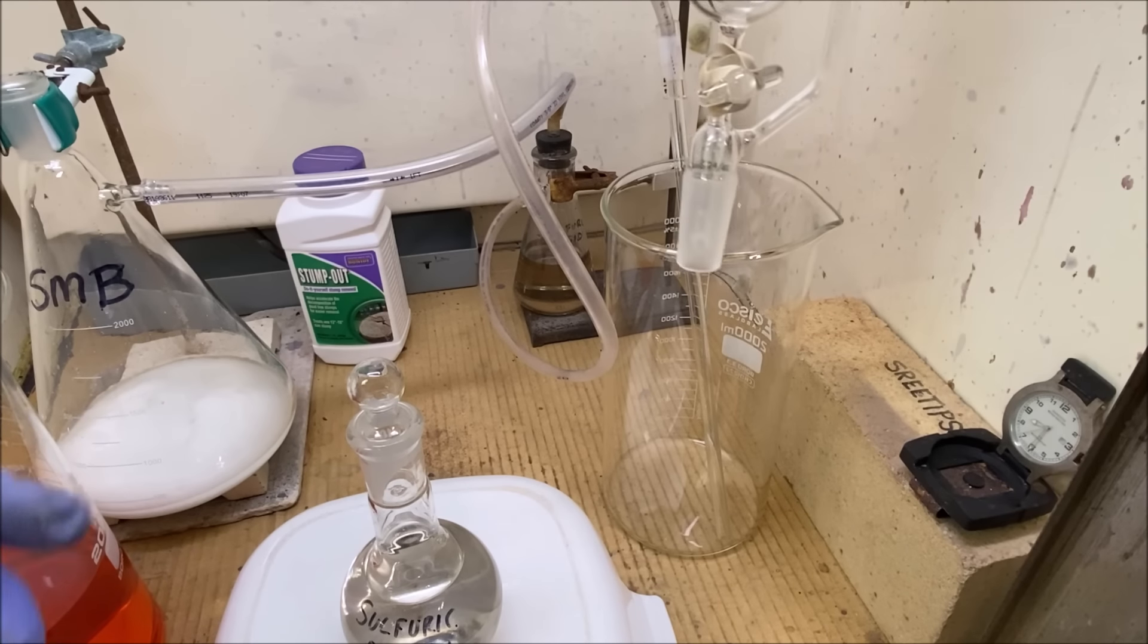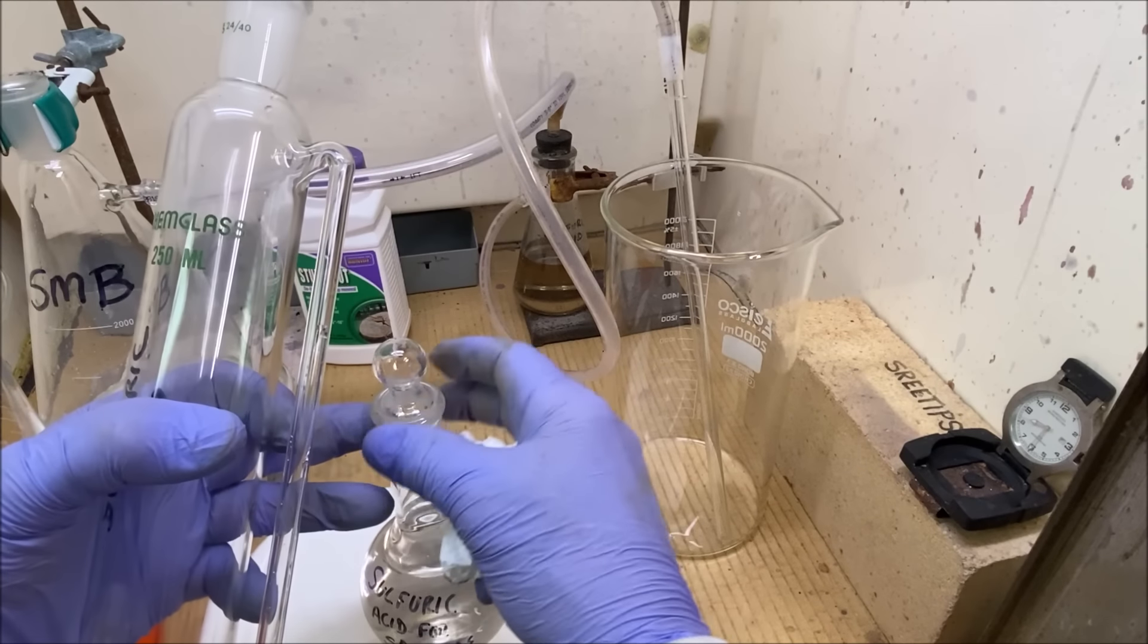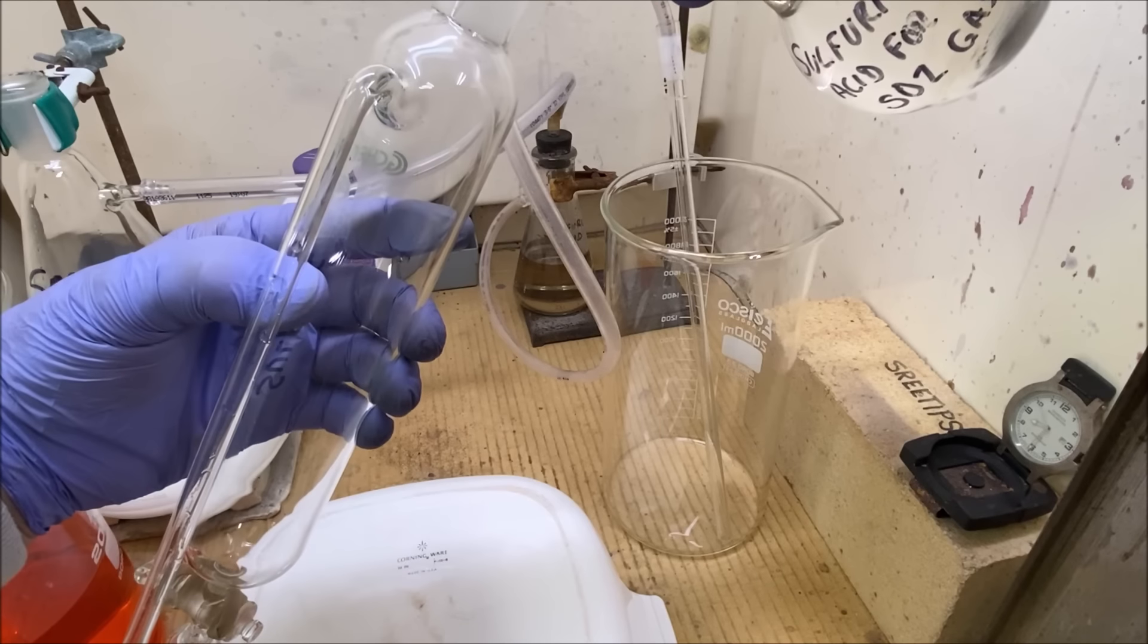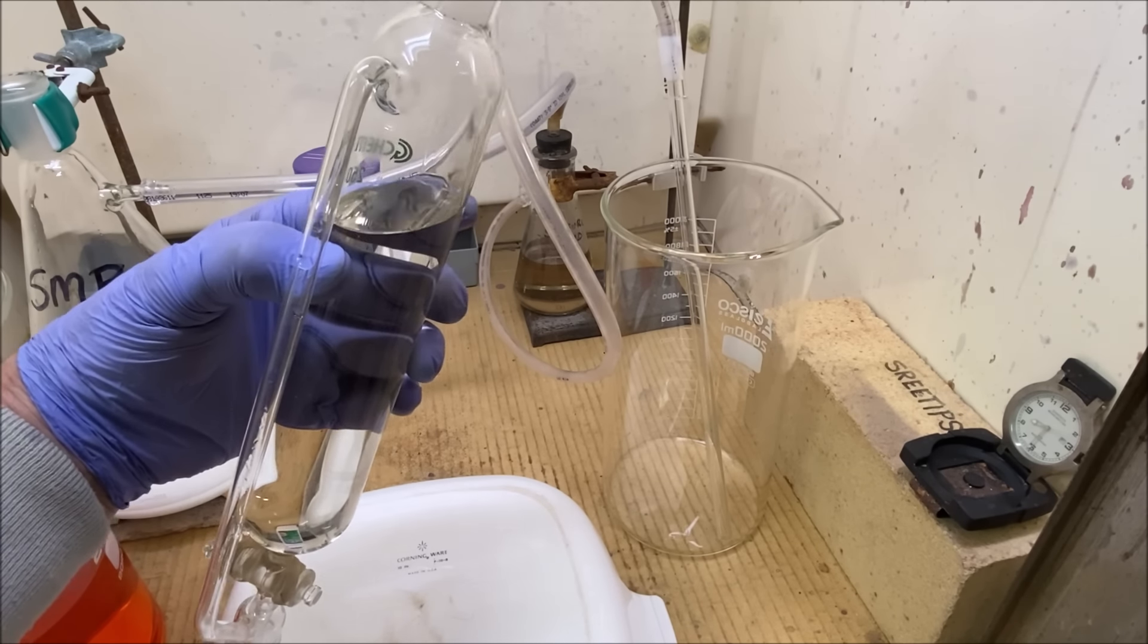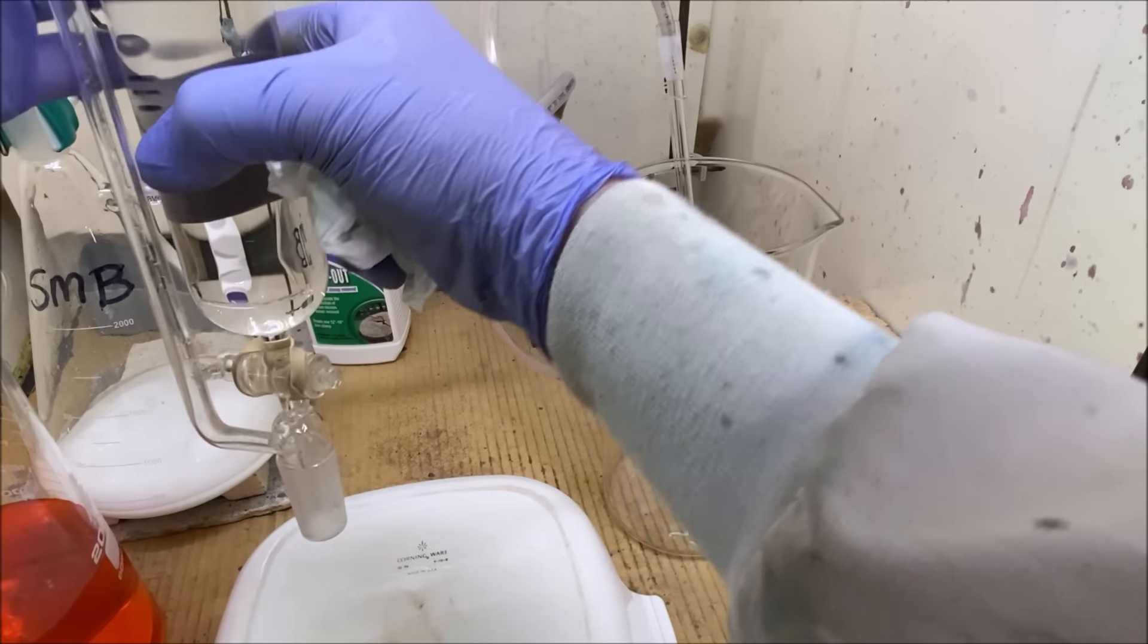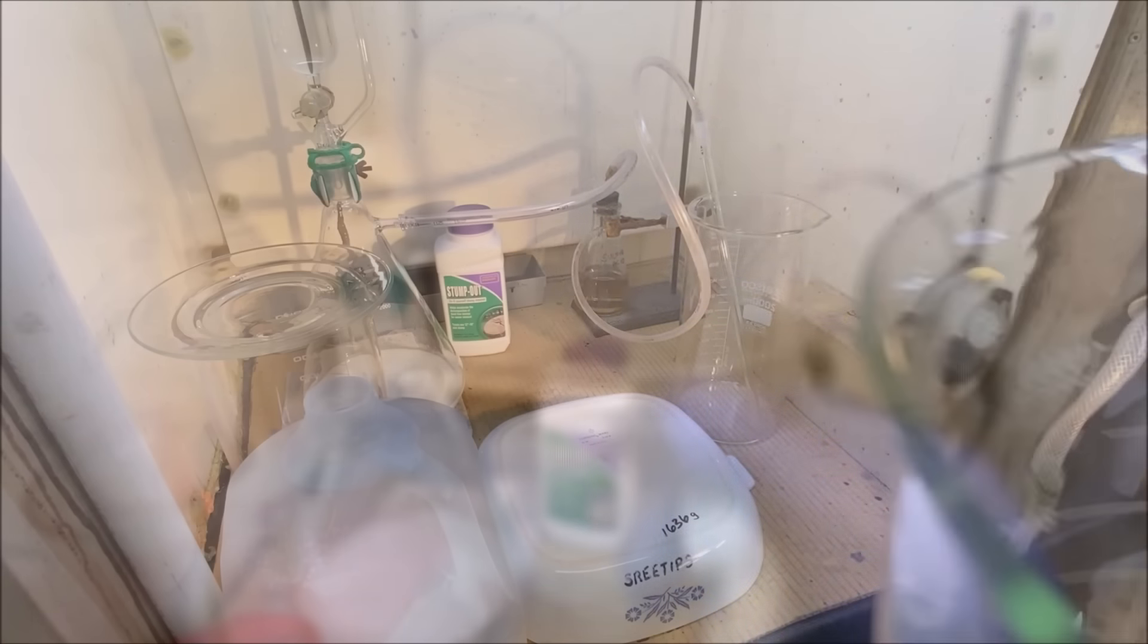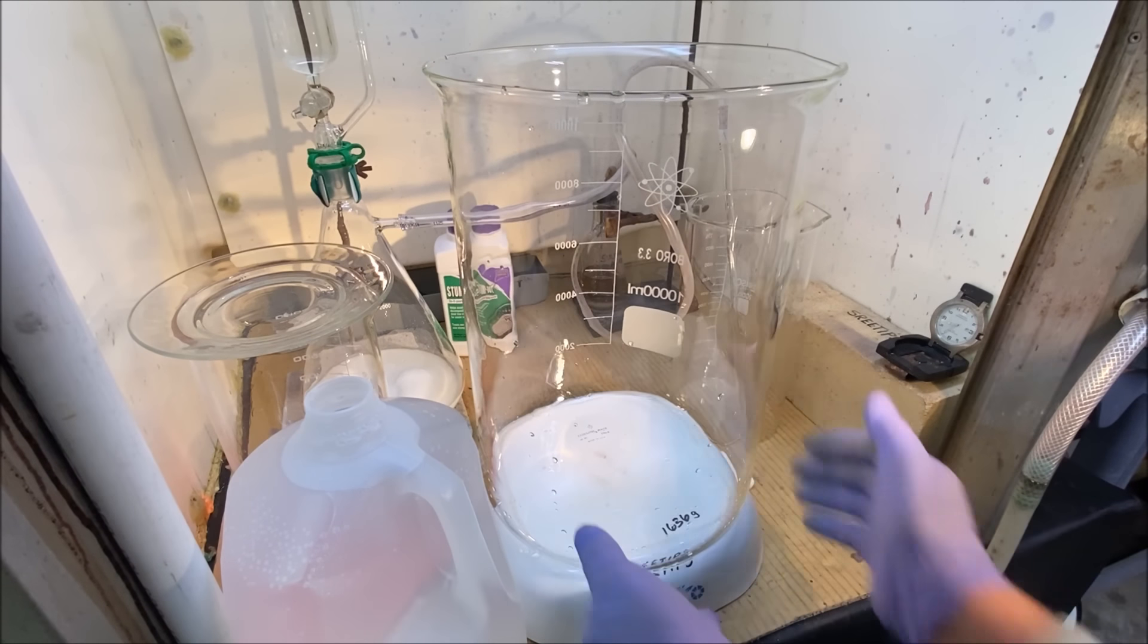All right, I've got my addition funnel here. I've got some sulfuric acid in this little flask. So what we'll do is go ahead and fill up our funnel with sulfuric acid. All right, there's that. I'm going to set this over here on top of our gas generator.